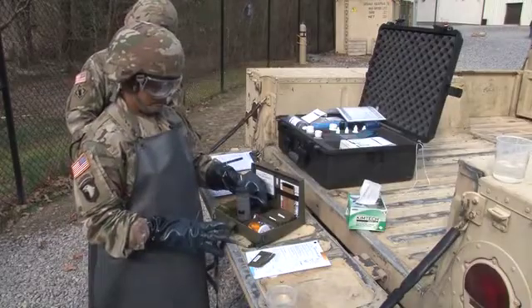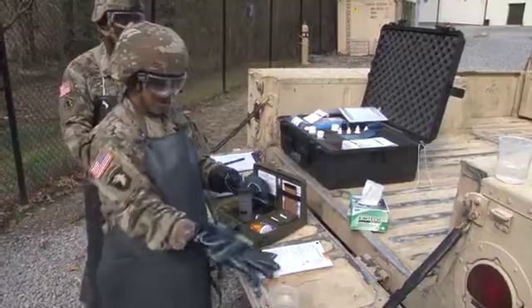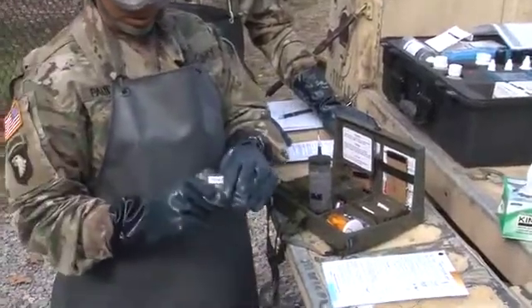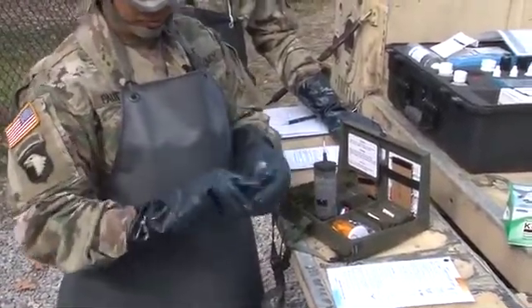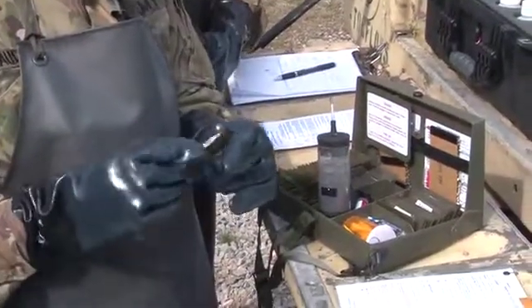You will be performing this test while you are waiting for your LEWISITE test results. Remove 1 white label envelope referred to as a ticket from the kit. Tear open the packet on the notch side and remove the silver-covered ticket.